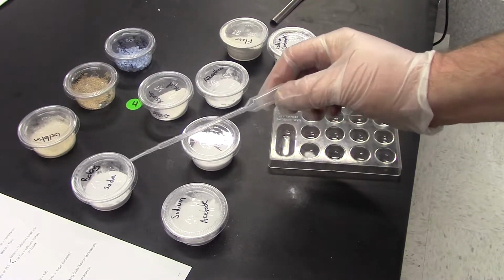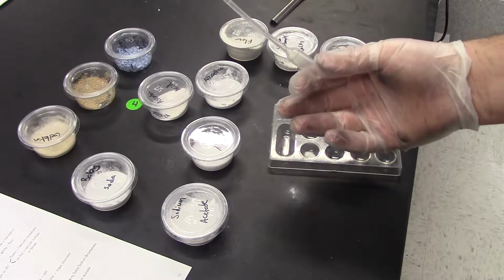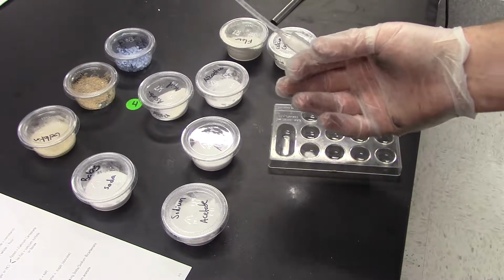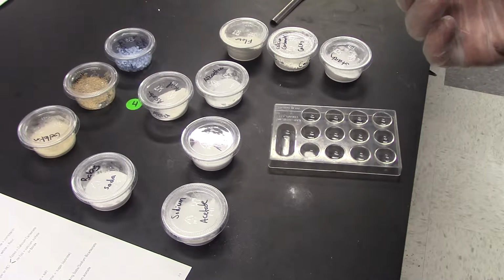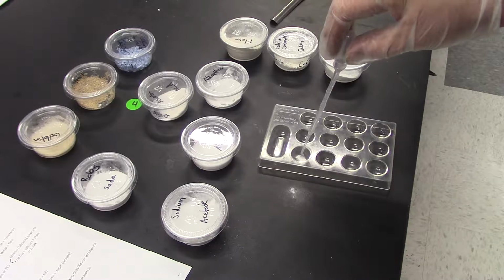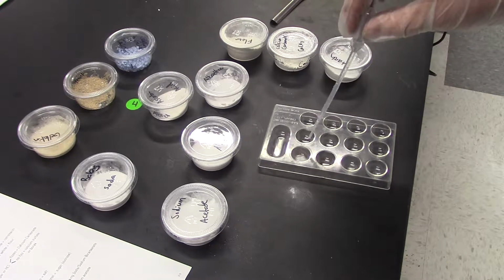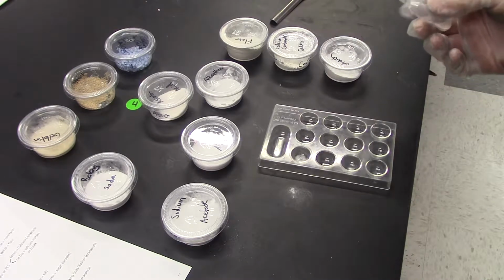These will want to be part of your kit. These are disposable pipettes, so you can put different solutions into them. And then at the end of your session, they can just go into the garbage. So I'm going to get some water. Water will most likely be provided by your supervisor, but it wouldn't be a bad idea to bring a small amount just for testing. So I put some water in it, and it's pretty nondescript. Nothing's really happening here.